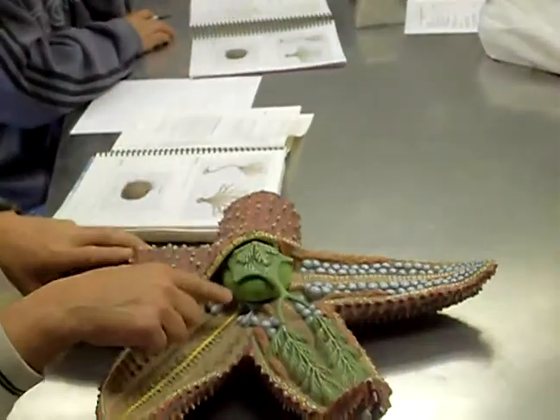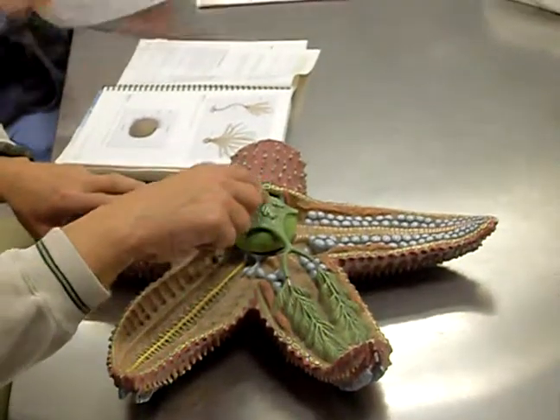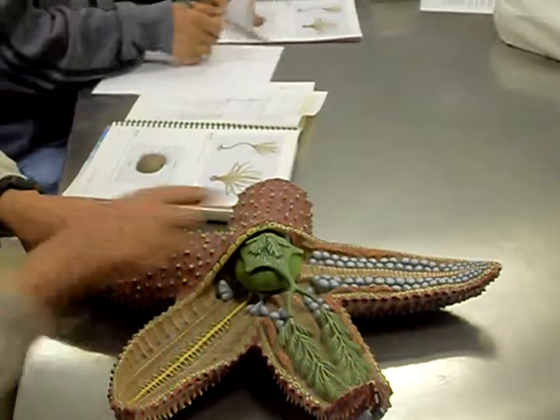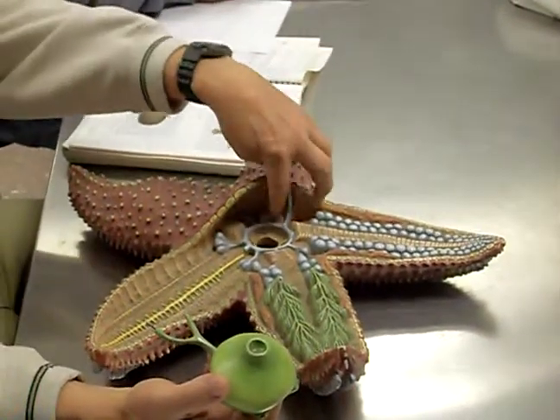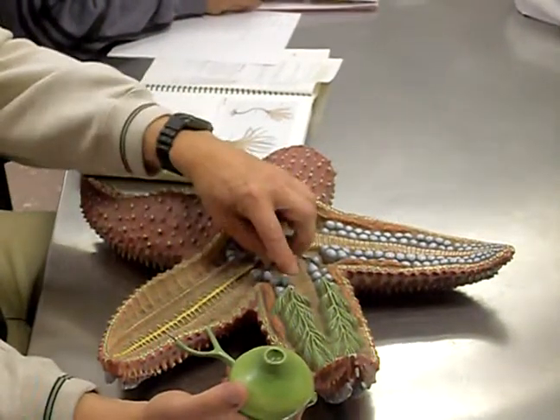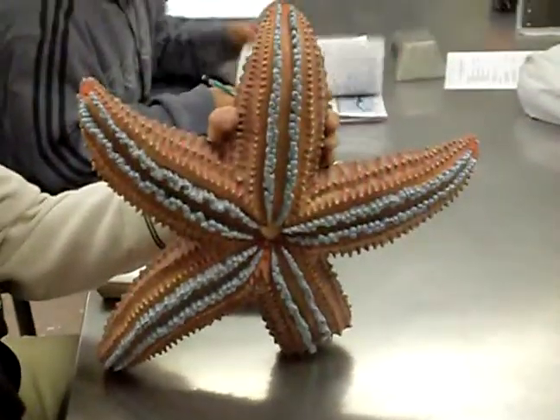To recap the main structures: mouth, cardiac stomach, pyloric stomach, digestive glands, the intestine and intestinal ceca, and the anus at the top. For the water vascular system: madreporite, stone canal, ring canal, radial canal, and then side canals branching to the ampulla — the bulbous part on top — and the tube foot, the part that comes out underneath.